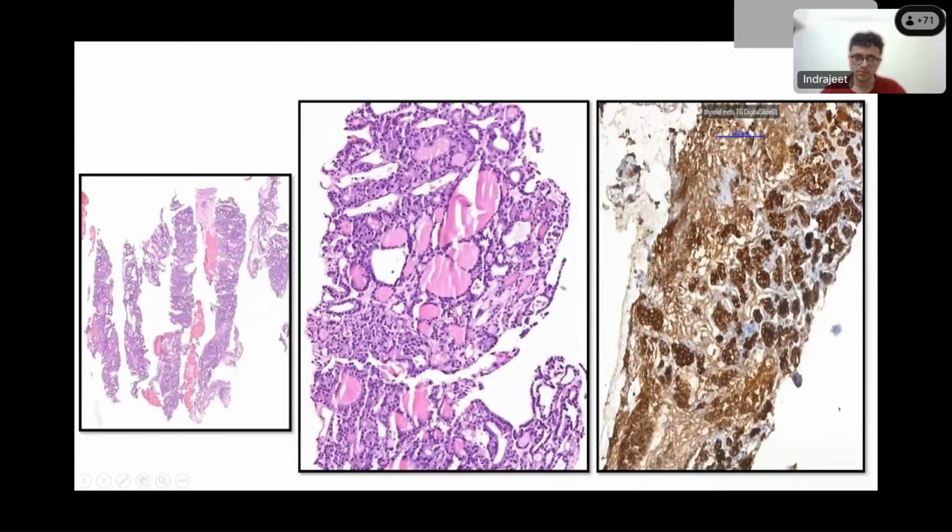What is this? Spot diagnosis. Quick. We don't have much time. Metastasis. Which metastasis? From thyroid, follicular carcinoma. Excellent. Follicular cells. Even if there is no history, you would be able to call it very confidently, because this just looks like thyroid. This is a follicular thyroid carcinoma.